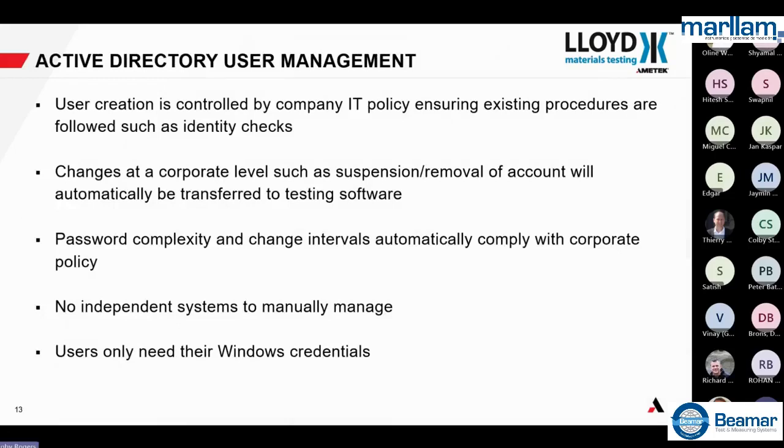Active Directory user management is something we mentioned. User creation is controlled by a company's IT policy. So, when a new employee joins, typically their identity is checked and so on. And once that's been done, they can be added into the Active Directory system. So effectively, only users that have gone through that process of being added to the company Active Directory can be added to Nexigen Plus software.